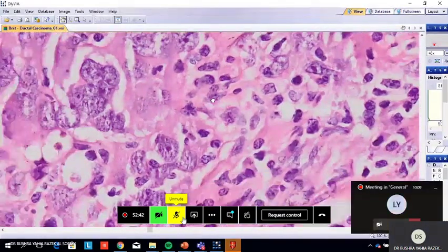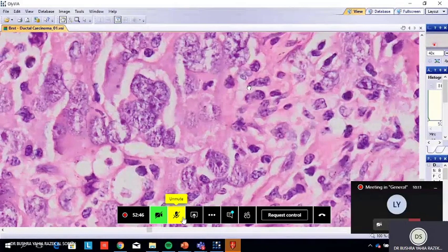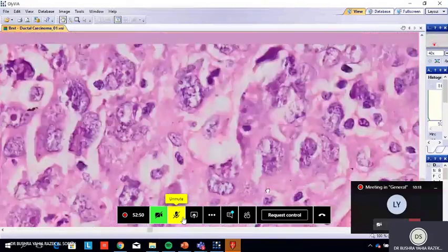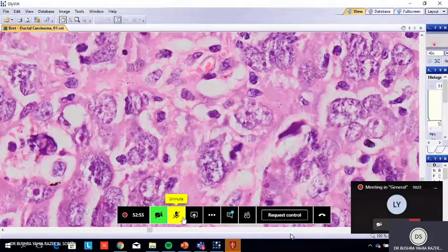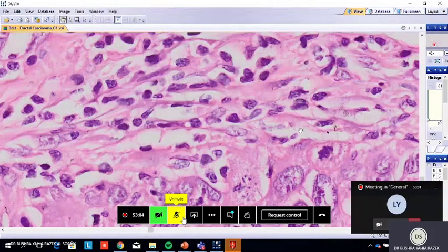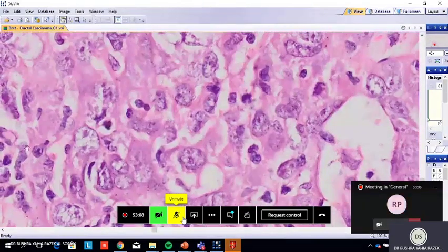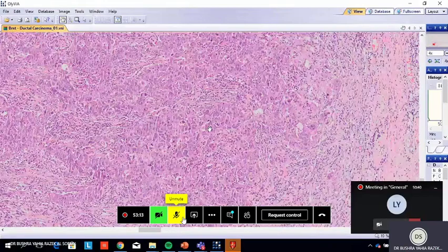Also, I cannot see. Look at the nuclei, they are very big. So now we have moved two fields already, isn't it? And this is 3. So 1 in 3. 2 in 4. So I don't think we are in the correct area.